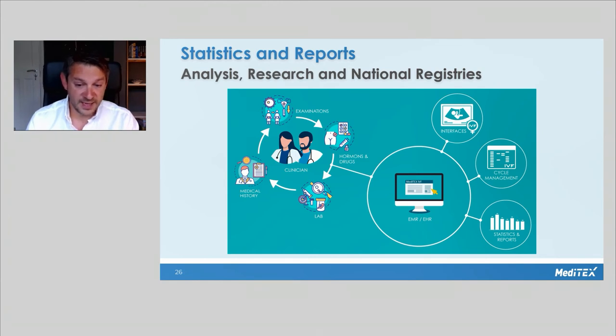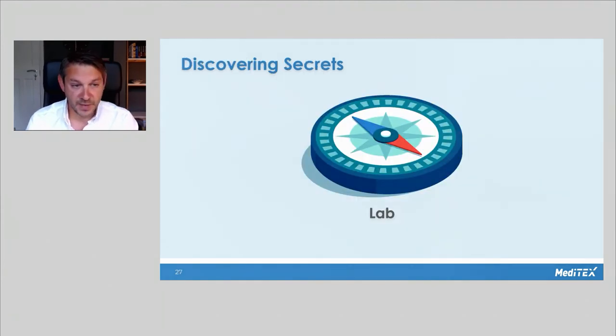In the UK, for example, the data submission to HFEA is required in real time at different stages during the treatment cycle. In other countries, data can be gathered and reported quarterly or annually. Our system should be able to enable that to happen. So that was clinical, or a few aspects on that. Now we're going to touch onto the embryology laboratory and see what systems are possible.